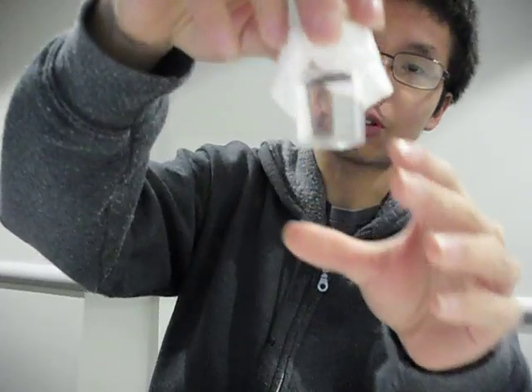In chemistry lab, we are tasked with growing alum crystals. This is the progress on the growth of the alum crystals after 14 days. While it's not very clear on video, I will show a photo of the alum crystals.